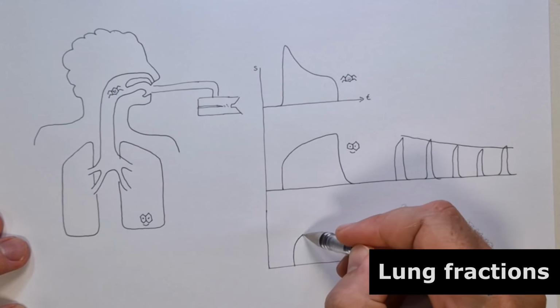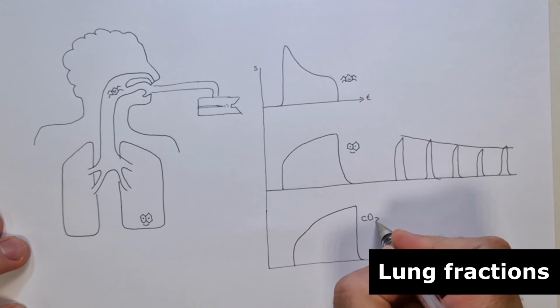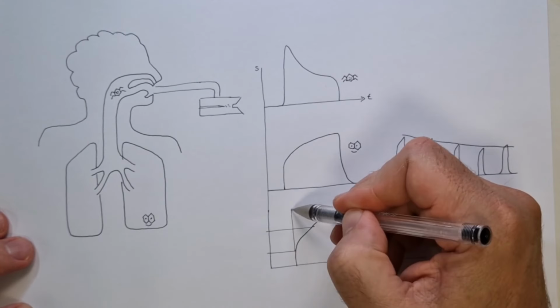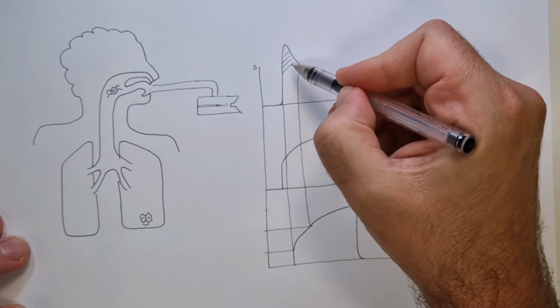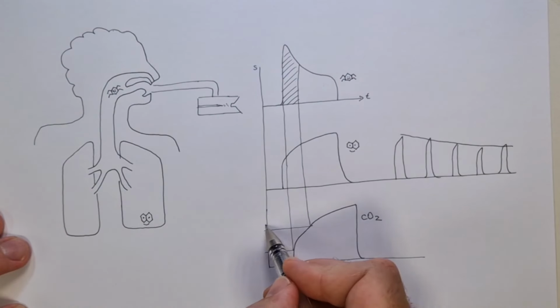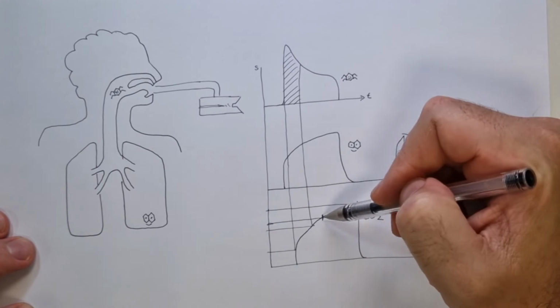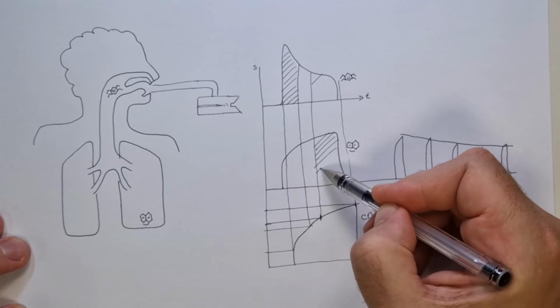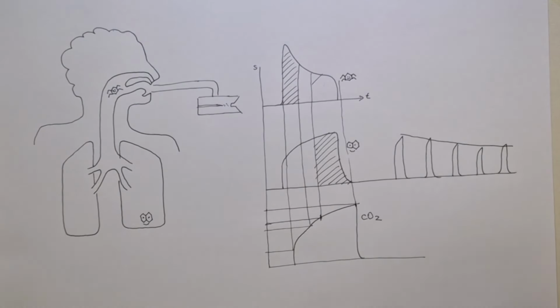A lung fraction is defined with CO2 and exhaled volume thresholds. Using Exhalation data, we find the time for which the exhalation was within those thresholds. And then we use the same time tags to average the signal of a metabolite detected by the mass spectrometer. If we're interested in the upper airways metabolites, we can set the thresholds to 1% and 2% CO2 concentration. If we're interested in the deeper part of the lung, we can set those thresholds to 3% CO2 concentration and beyond. Those average values are the input to our data matrix.